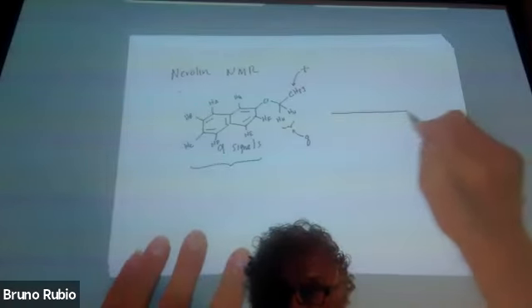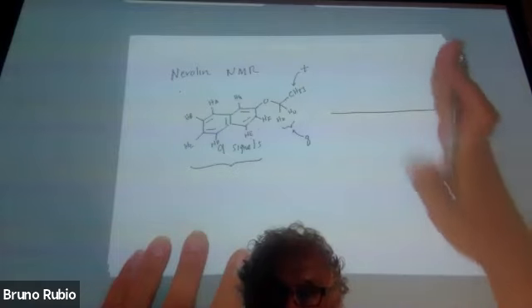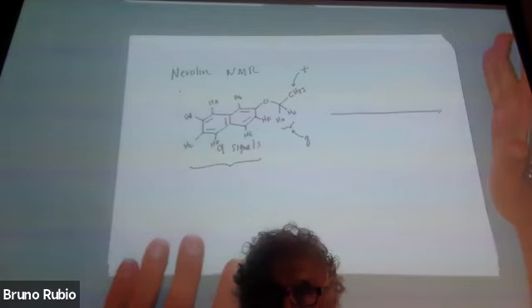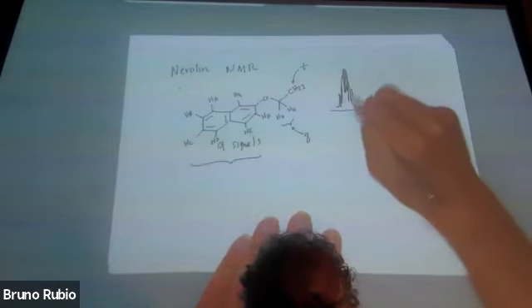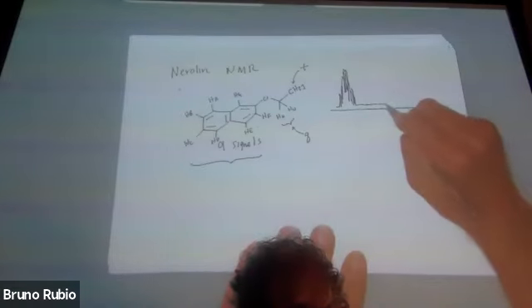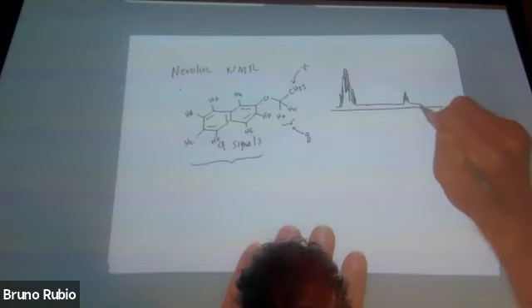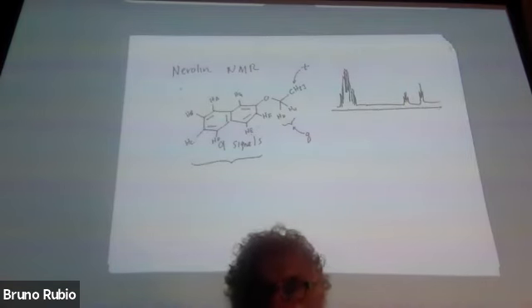So in the nerolin NMR, who's going to be more downfield, the quartet or the triplet? Or who's going to be more upfield? Most upfield signal, is it going to be a quartet or a triplet? It's going to be an upfield triplet. So the NMR of this guy is going to look like this: a mess, a mess, a mess. 9 signals, a bunch of doublets, and other stuff. It's going to be a mess, but up here, you're going to have a very nice quartet. And then you're going to have a nice triplet up there, right? So the NMR is going to look something like that.